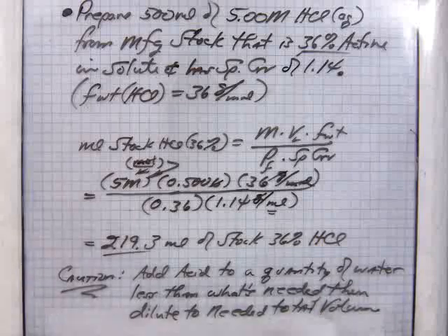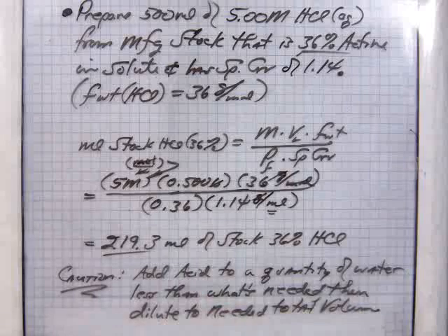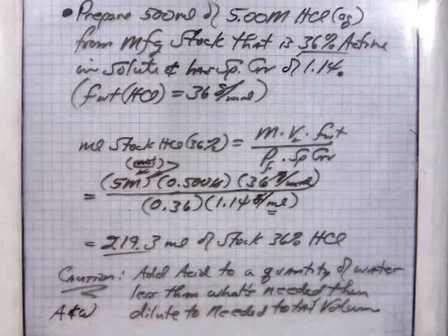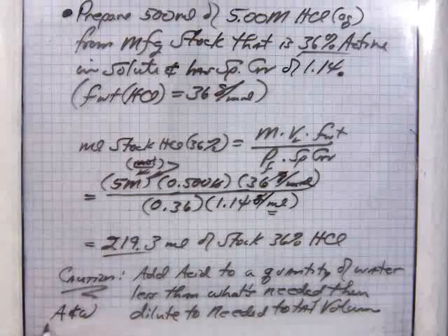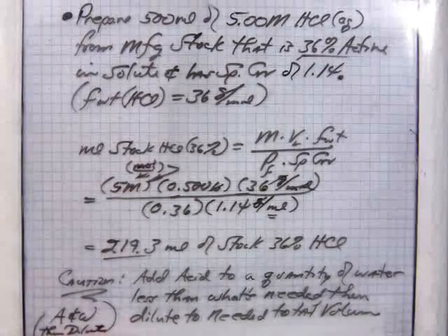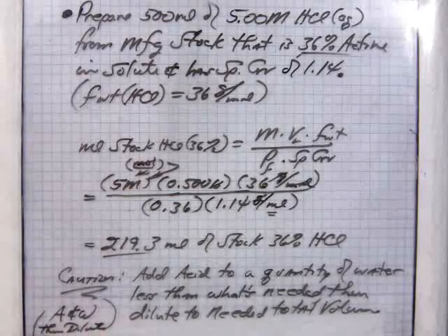And so essentially that's the approach. Some people say, remember A and W root beer. Acid to water, then dilute. So keep that in mind.